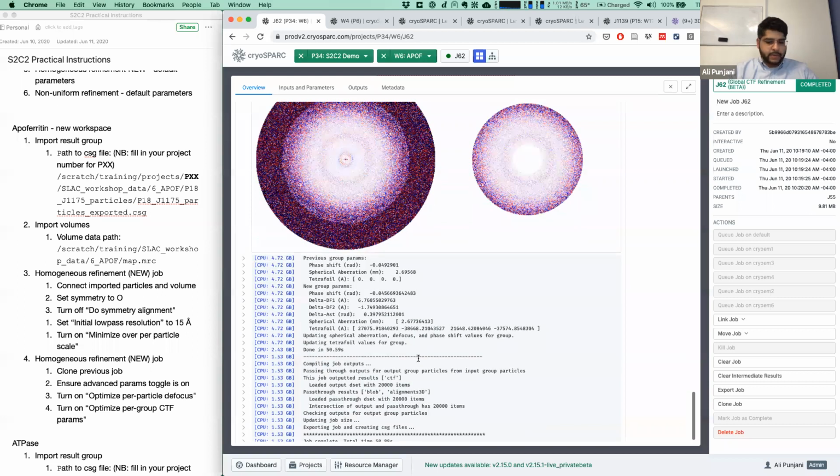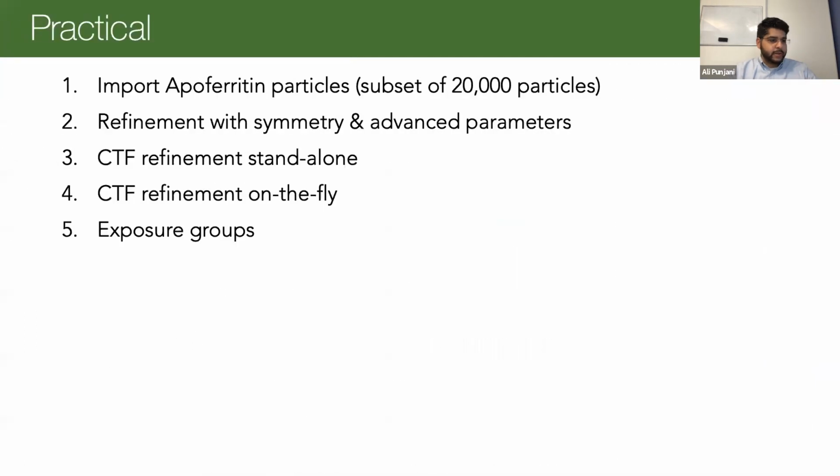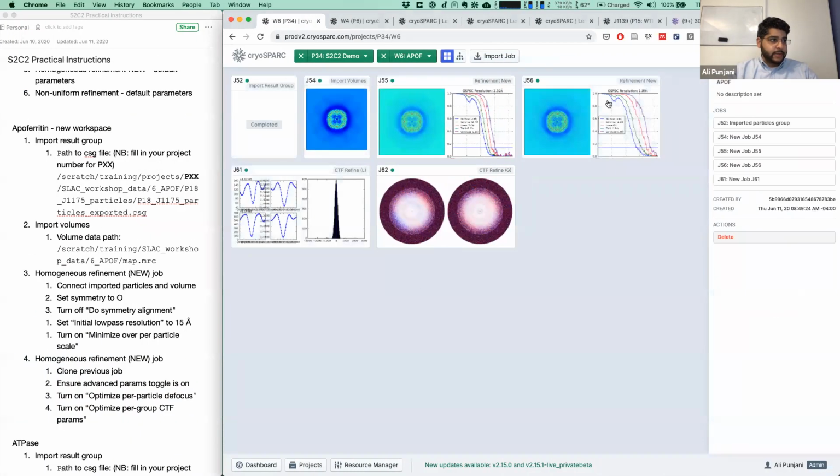It doesn't end up having actually too much aberration left to correct. But in other data sets, you can see very strong aberrations. If I just go back a couple slides here, very strong aberrations that end up creating these patterns called Zernike polynomials that account for the phase shift in different parts of the diffracted beam. So once those are corrected, resolutions can reach much higher.